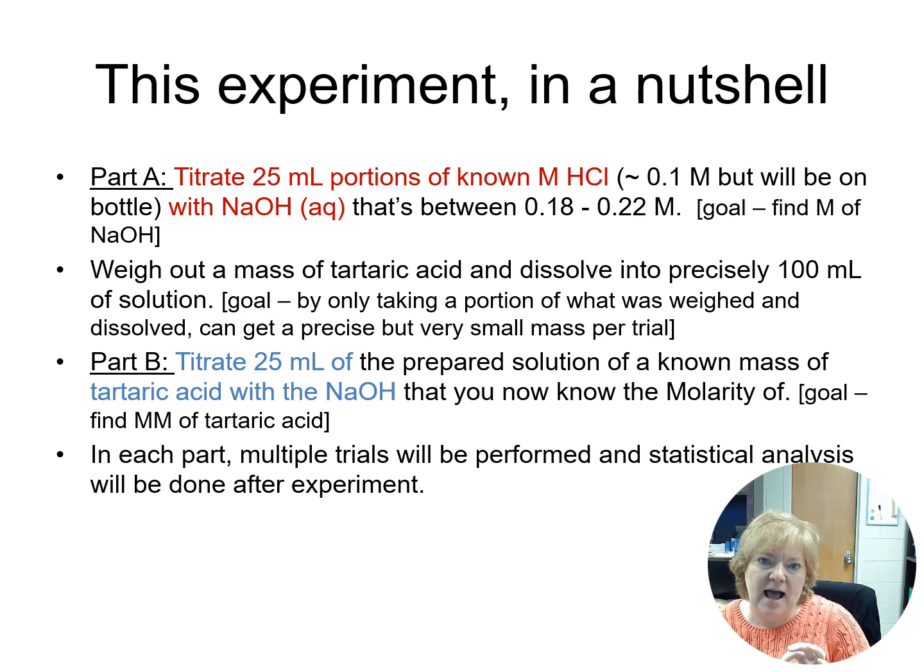All right, then the next task is I want to weigh out a very small sample of tartaric acid, something like only 7 milligrams, so it's like 0.007. I'm not going to get an accurate measurement of that on the scale. I think actually the number we need is 0.020, so 20 milligrams. It's a small sample. I'm not going to be able to weigh that out very precisely because my scales only go 3 decimal places.